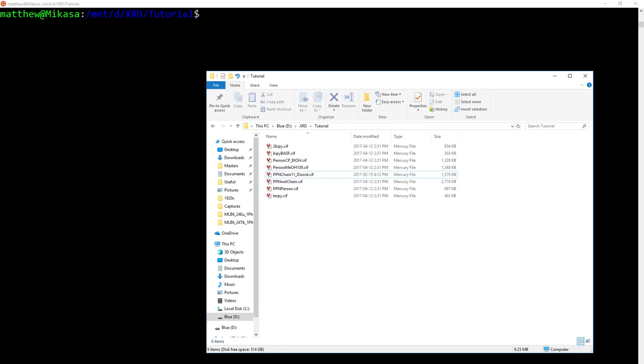Hello, I'm Matthew Brown, a PhD candidate at Simon Fraser University. The question came up in my group as to how to make a master CIF from a series of CIFs using my method of using Olex 2.